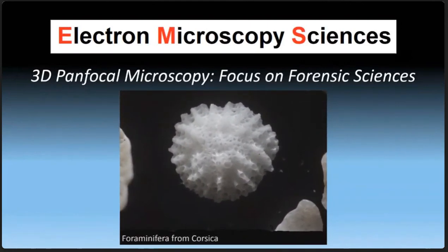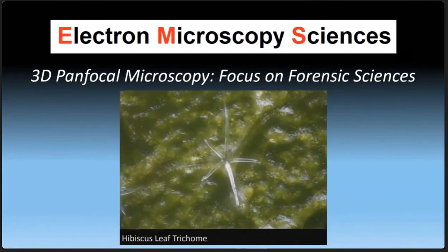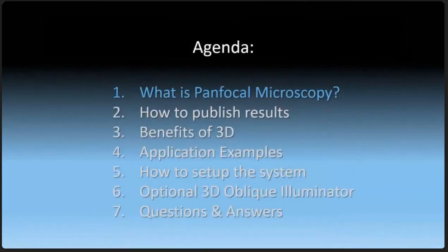So today we're going to talk about 3D panfocal microscopy. Here is the agenda for the day. We're going to talk about what it is, how you publish results, what the benefits are of 3D, give application examples, show how to set up the system, and show you an interesting optional 3D illuminator. And then we'll have some questions.